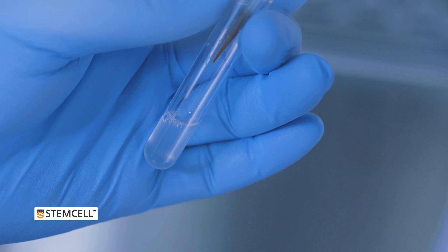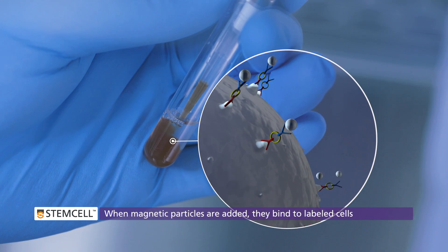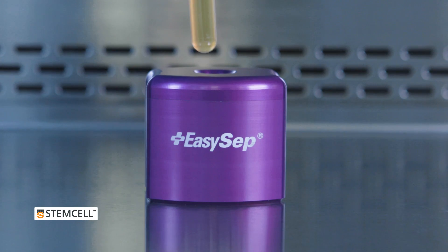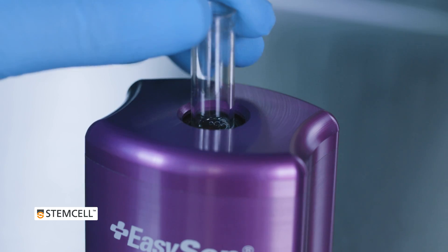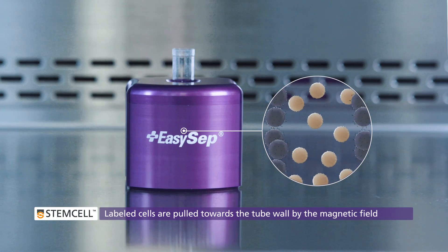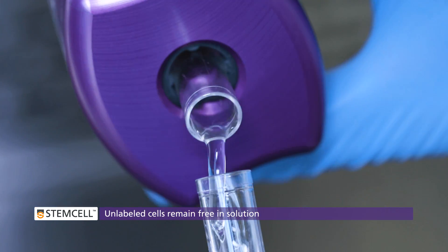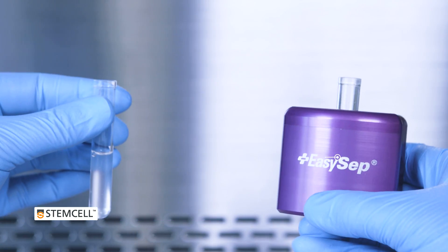When the magnetic particles are added to the labeled sample, they attach to the free end of the antibody complexes. As a result, when the tube is placed in an EZSEP magnet, labeled cells gravitate towards the tube wall and are held in place by the magnetic field. Unlabeled cells remain free in solution and are simply poured off into a new tube.